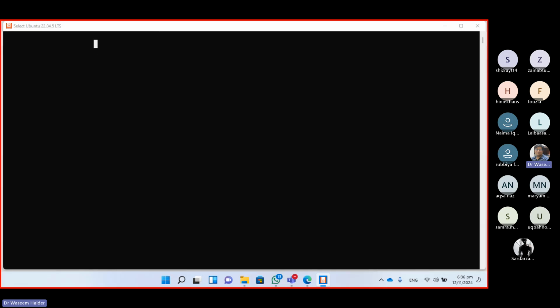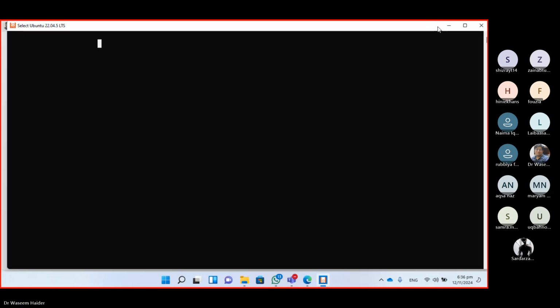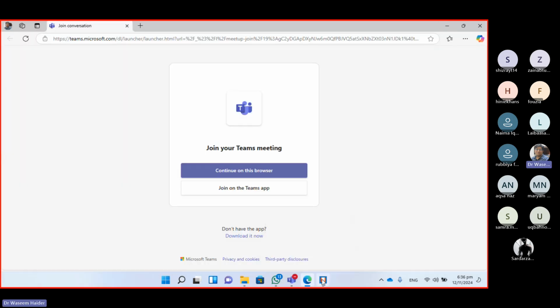I don't know why this guy is so slow or so dumb. I'm just waiting for him to return, and then I can restart maybe. So here is my Ubuntu.